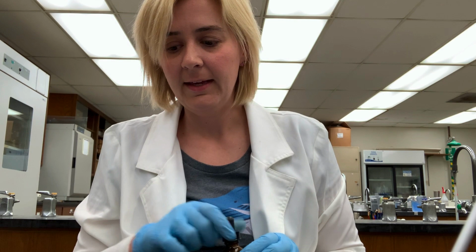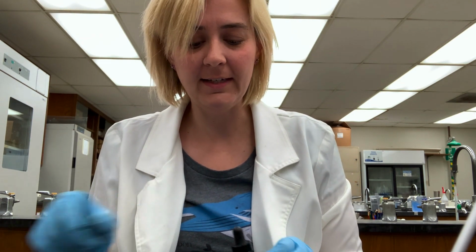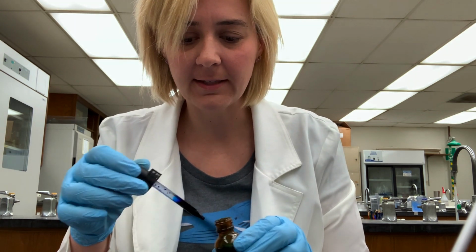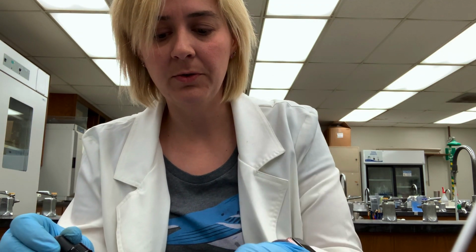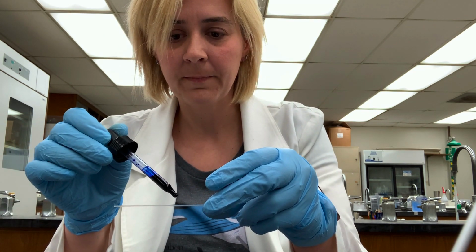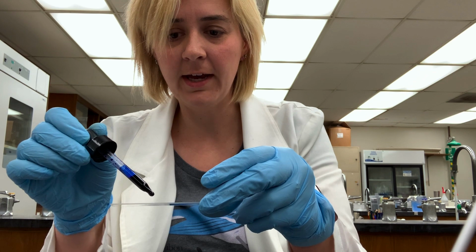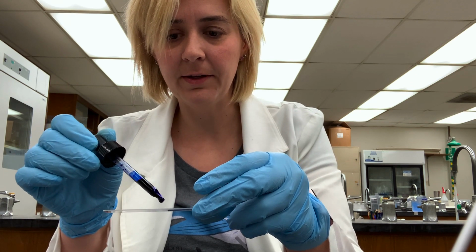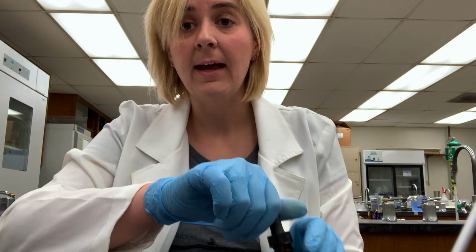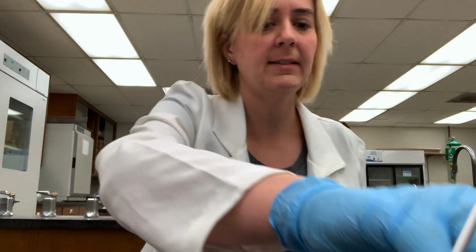And the thing with methylene blue is that it actually has to stain for about 5 minutes. So of course I will pause the video and not make you watch me for 5 minutes. But I am going to add my stain to the slide and completely cover the area where I smeared the bacteria. Now I'm going to place my slide down and let it sit for 5 minutes.